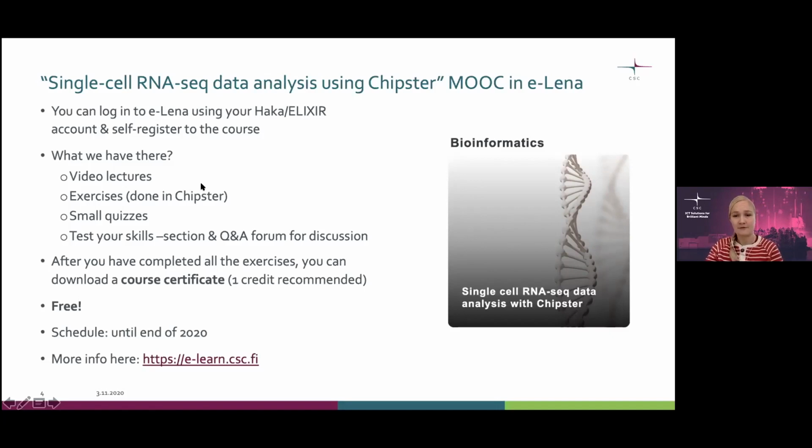In the course we have video lectures and some exercises which you will be doing with Chipster software, and small quizzes. And in the end you have this test your skills section where you analyze your own data more independently. And there's also this questions and answers forum for discussion. So there you can get help and see what other people are struggling maybe with. So you can share information nicely there.